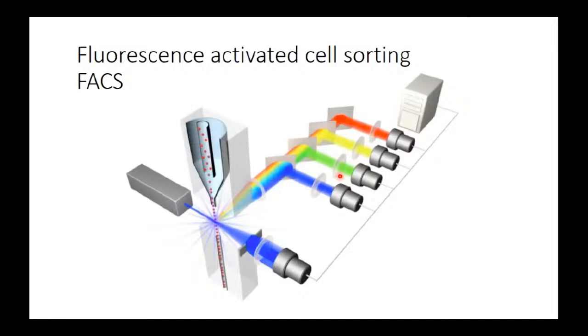We can also combine the data together, so I can form this two-dimensional histogram again, but with protein 1 and protein 2. So I have the signal coming from fluorophore 1 and fluorophore 2. When the cells are here, it means that these cells are expressing both proteins, because they are giving a high signal on the first detector and on the second detector.